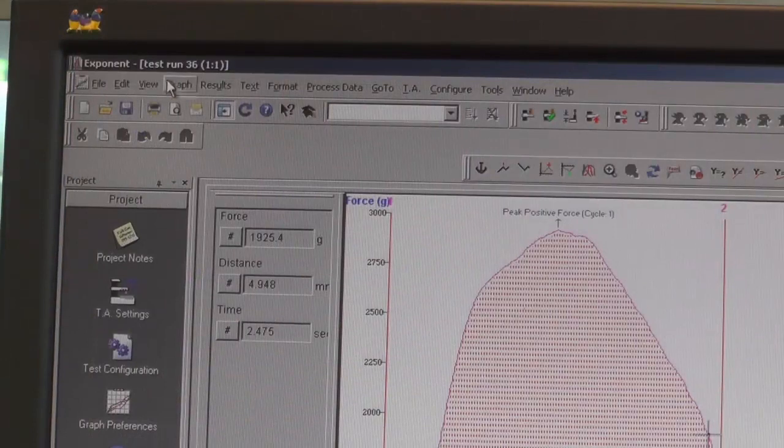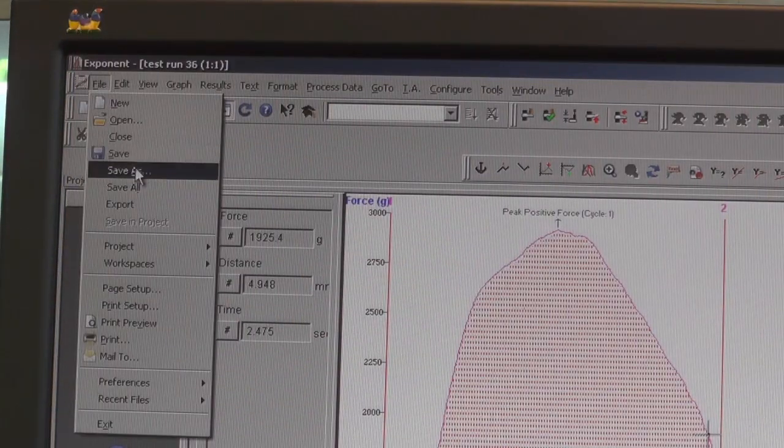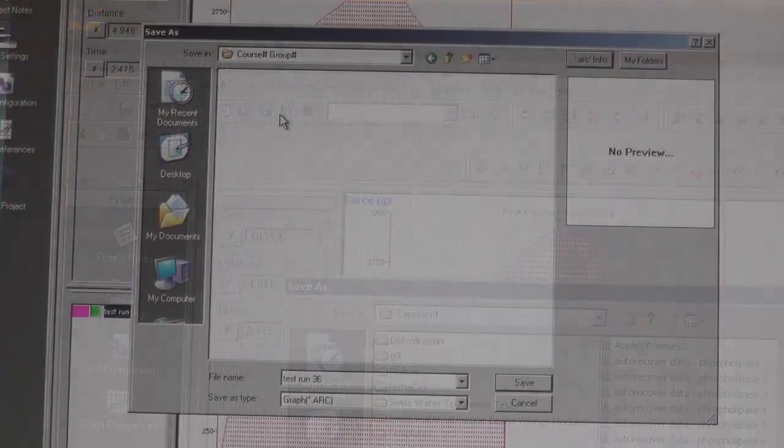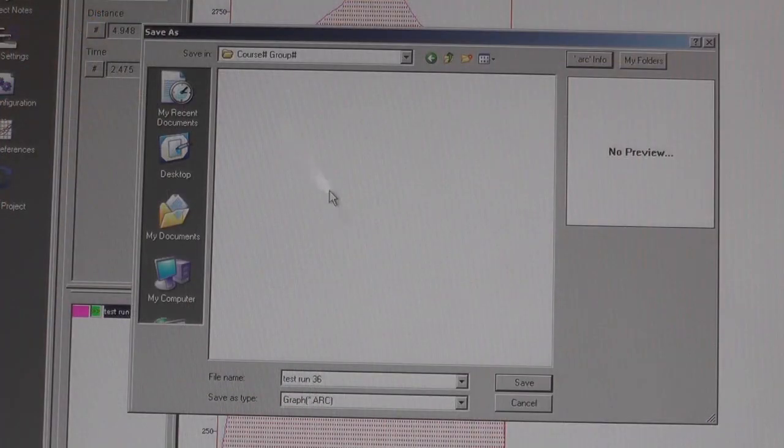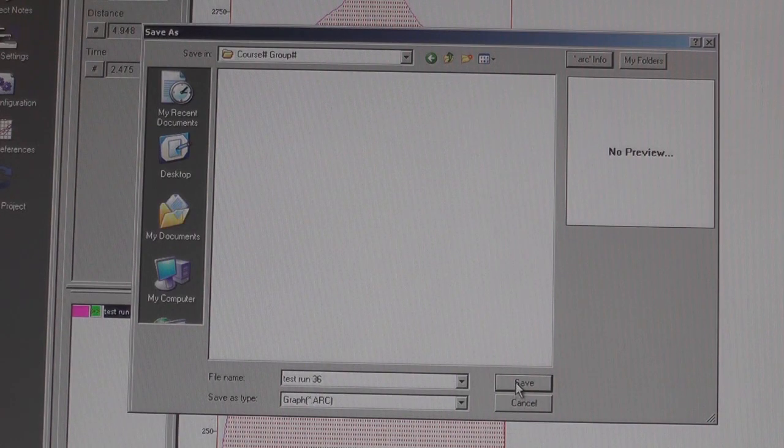To save your test results, click on File and Save As. Create a folder with your course name and group number and save all your files there.